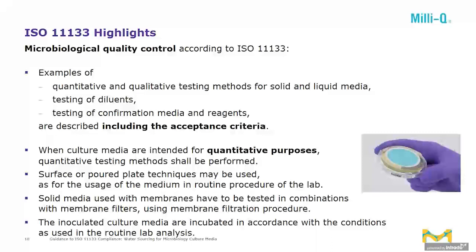When culture media are intended for quantitative purposes, quantitative testing methods shall be performed. For surface or pour plate technique, the usage of the medium is in the way as the medium in routine procedure is used in the lab. Means if you are using your culture medium with surface plating technique, the quality control, the performance testing is also done by surface plating, and the same for pour plate technique.